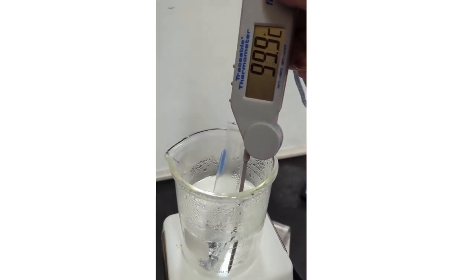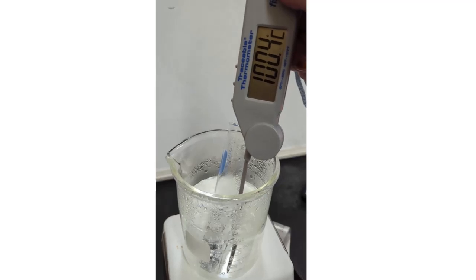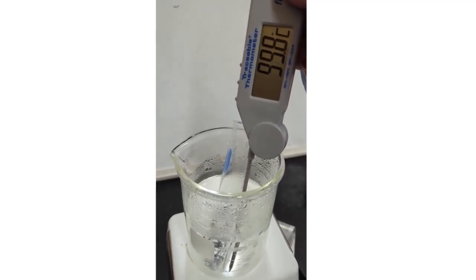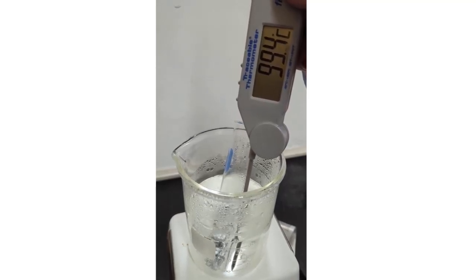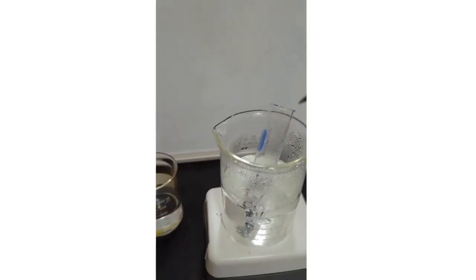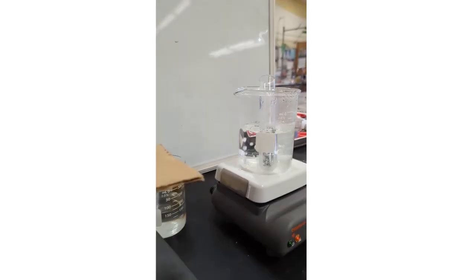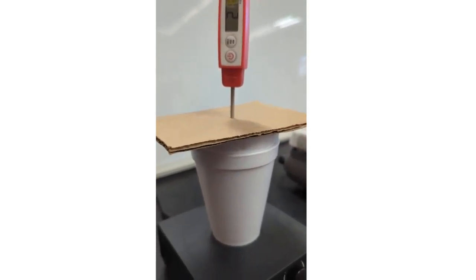And our water is boiling, so the temperature on the thermometer is definitely going to jump around quite a bit. I'm just going to try and find the number that I see appear most often, and that's going to tell me what I'll use as the initial temperature of my metal. All right, so it's kind of staying around that 99.4 to 99.6 area, jumps up every now and again. So I saw 99.6 jump around the most, so I'm gonna take that and call that the initial temperature of our metal. What I'm gonna do now is take that hot metal out of the water bath and quickly dump it into my calorimeter here.